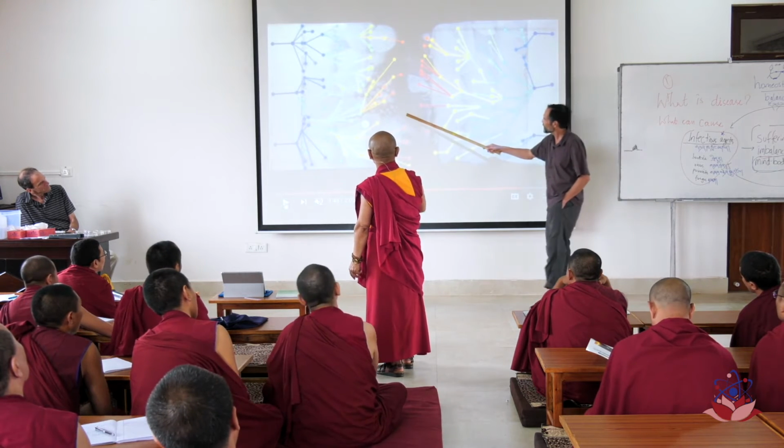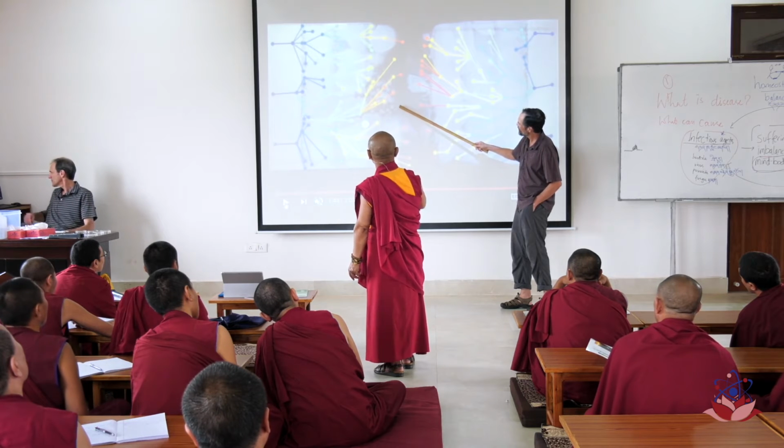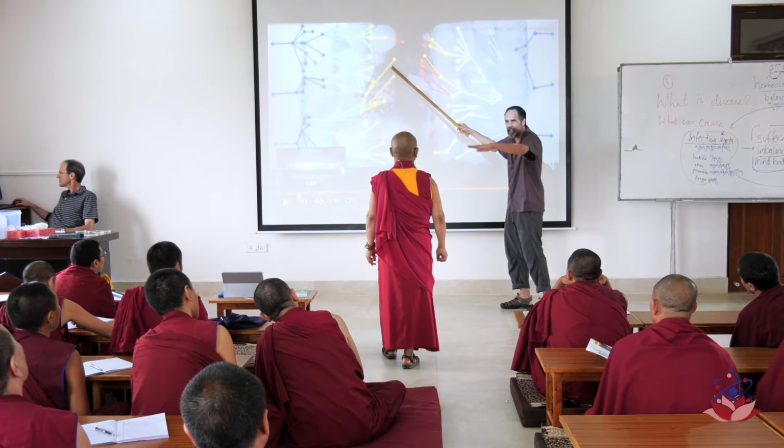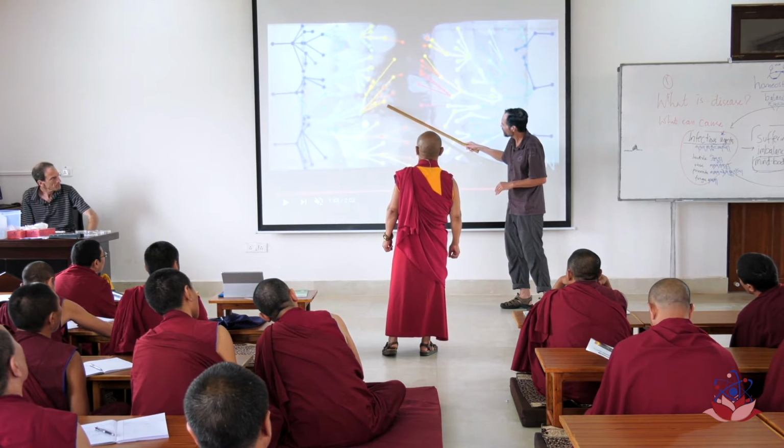Third kind of growth is here. Because this is a very fine haze, and then out of it come individual clones.